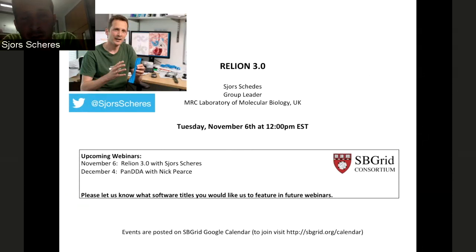As you could see, the spliceosome parts of it weren't very ordered at all. I think the main limitation in application of multi-body refinement is the minimum size of the individual bodies. Because you're going to subtract all of the rest away, there needs to be at least, I would say, about 150 kilodaltons worth of mass within each body. If that's the case, then quite big motions can be refined.